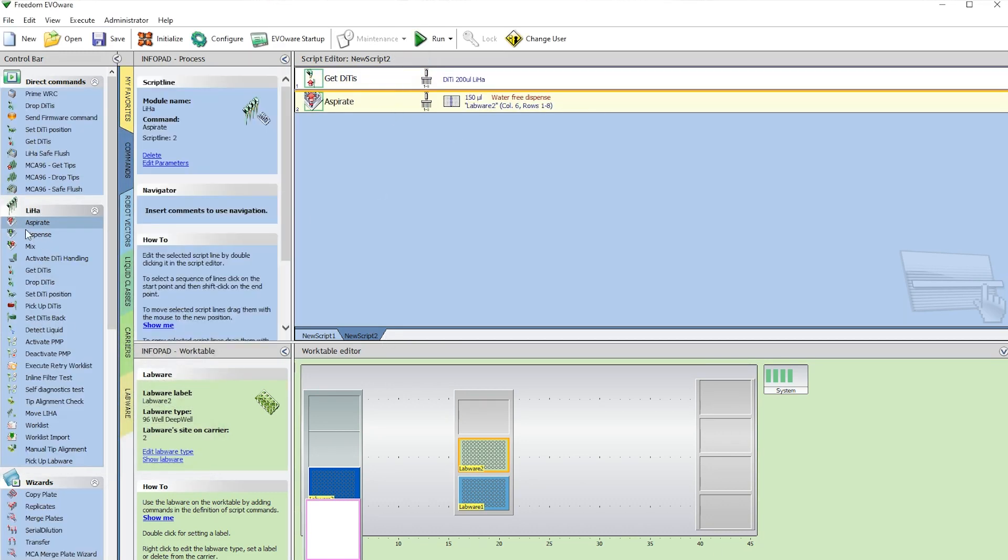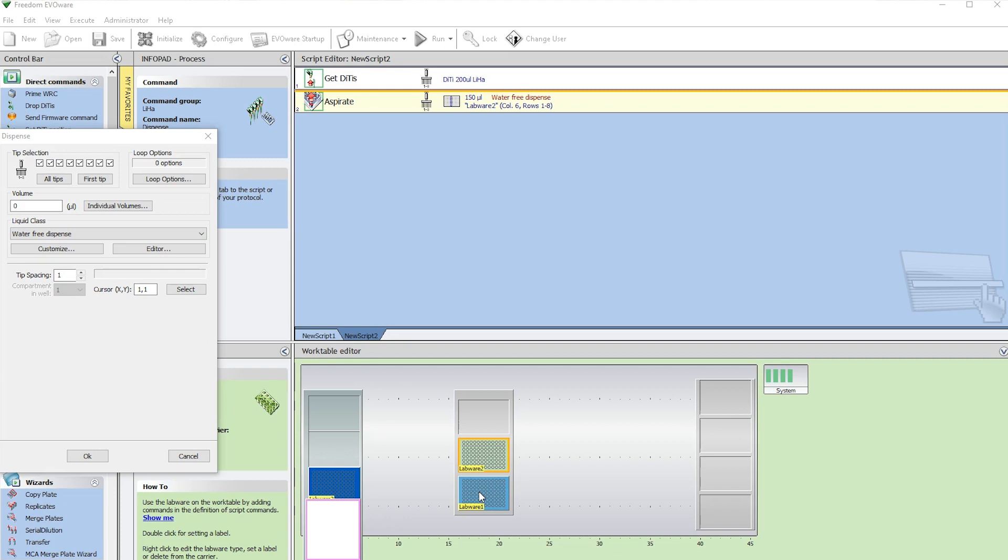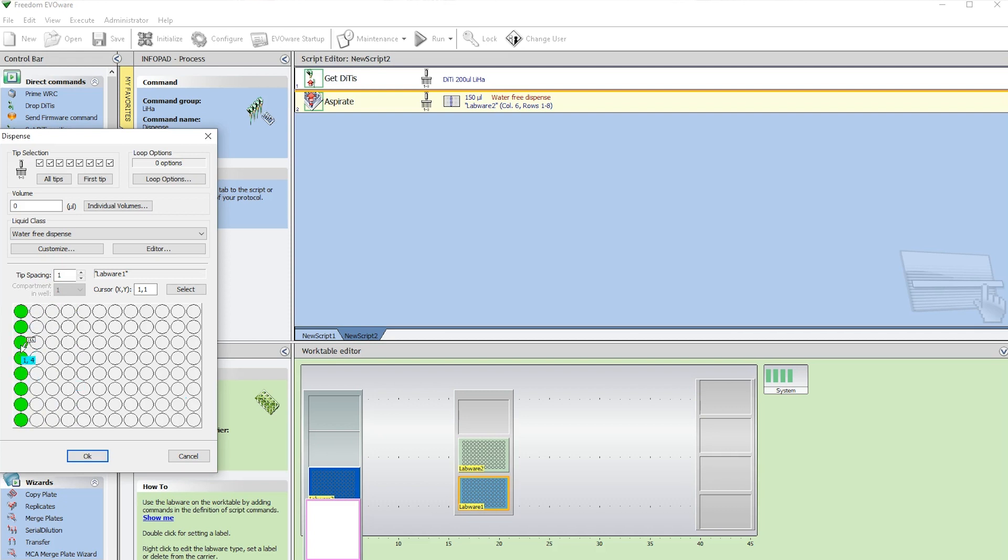Next, our dispense step. Double-click there. Select the labware we want to end up in. We can select any column on the plate we want to dispense into. I'm going to select the first. We can give it a different volume than our aspirate step, but we can't go above it. So we can do anywhere from 0.5 all the way up to 150 microliters. But for this, we're just going to do 150 since we aspirated at 150.